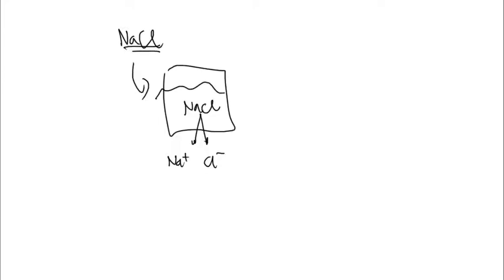However, not all compounds will do this automatically. When we're given something in a laboratory and we want to measure mercury, we have to make sure that mercury is freed up. If we want to measure zinc, we have to make sure that the zinc is freed up. In this case, sodium chloride breaks apart very easily into Na+ and Cl-, and these are free.